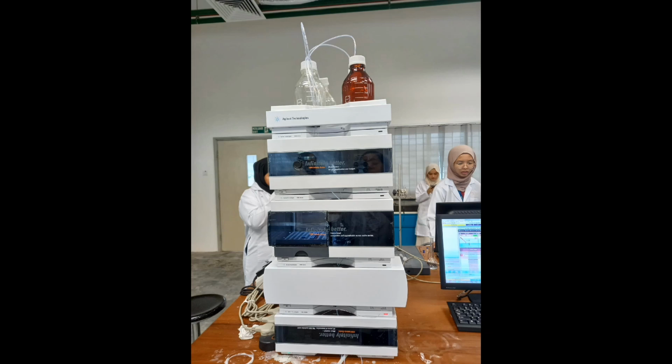In HPLC with RID, the refractive index detector is particularly useful for compounds that may not have strong UV absorbance, as it detects changes in refractive index caused by sample elution. When working with RID, it's important to optimize the chromatographic conditions, including the choice of stationary phase, to achieve the best separation and sensitivity for the targeted analytes in the sample.